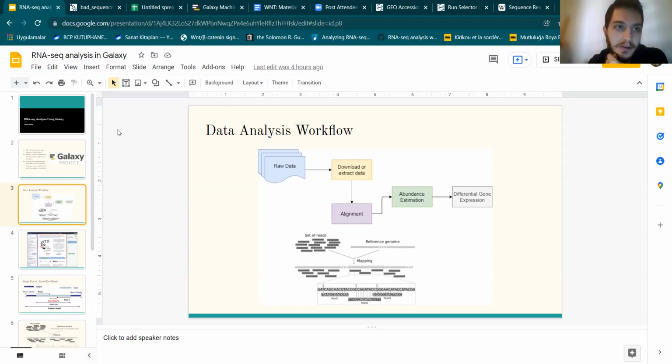I got another comment about Galaxy in general. They do have images of Galaxy itself, so it's not just 3 websites that run on different continents; you can also deploy it to your own beefy machine, or preferably a server that you can use locally.